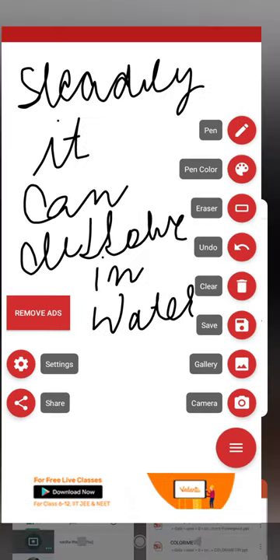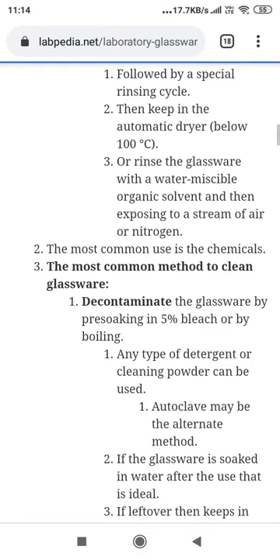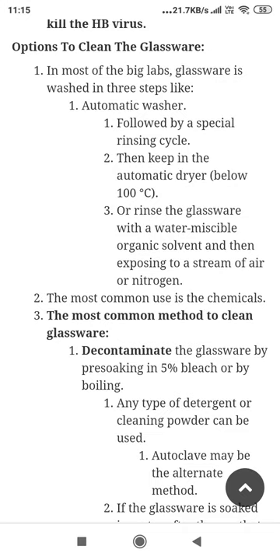Now, our main topic is how we can wash glassware in our laboratory. Actually, this is a practical thing. Right now, we are just reading it so that in the laboratory, we can easily handle these kinds of glassware. So, we have three options to clean the glassware in our laboratory. First, in most big labs, glassware is washed in three steps. We have an automatic washer.